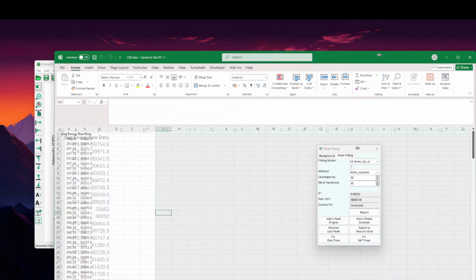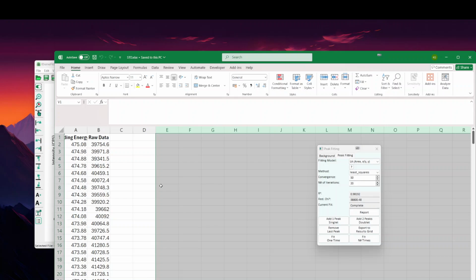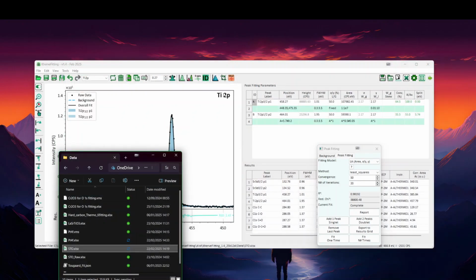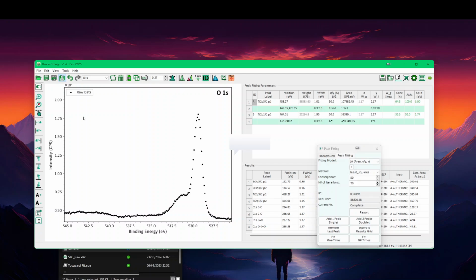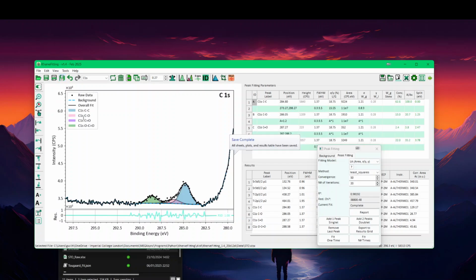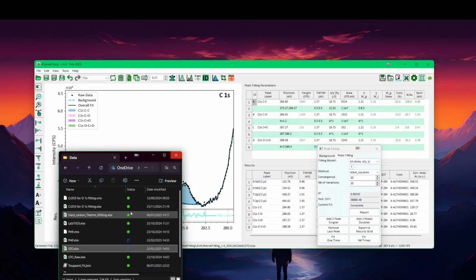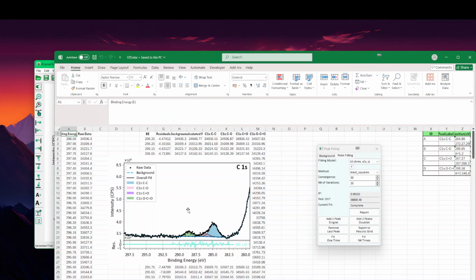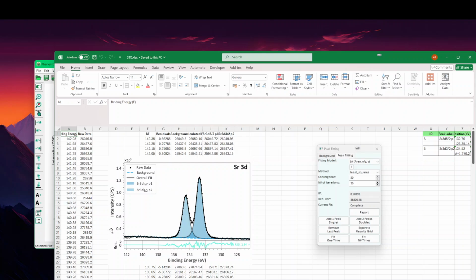you're going to see this data looks like this, where nothing has been saved, and I have to close it. But now if I save all, and the save is complete, I go into the STO file again, and you can now see that the plot has been done, let's say, in a publication-ready format. Yeah, if you're not happy with the way it looks, you can still change it.